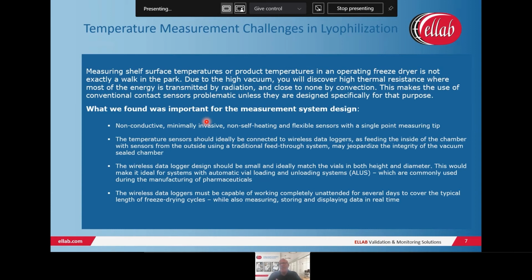So there were considerations about what these sizes should be, what should be the maximum freeze drying capacity, and we know that many of these cycles take days. Fortunately for us, you don't really need very high sample rates. That means for samples, you can live with several seconds or even minutes, because it's a very slow responding process.